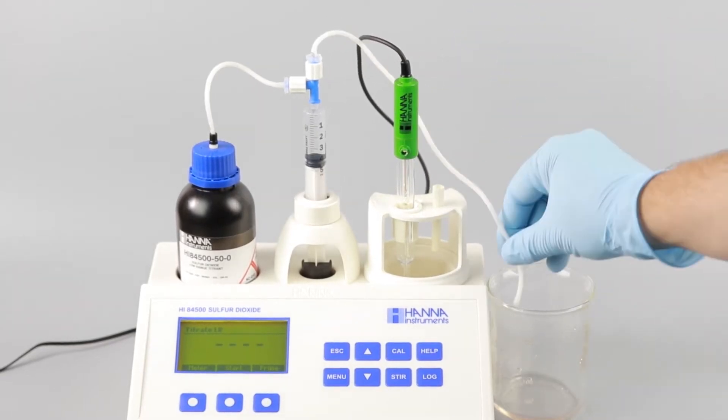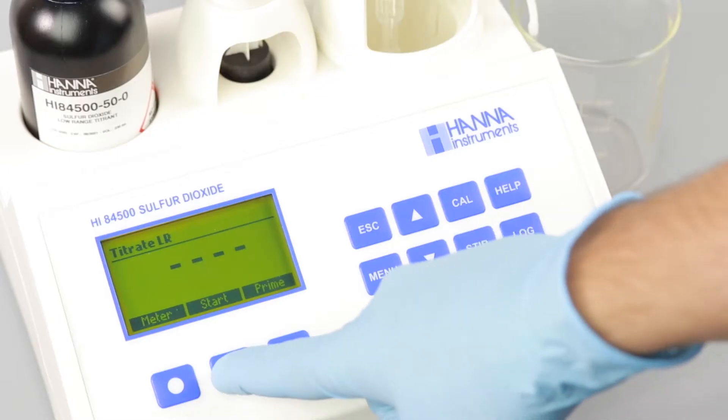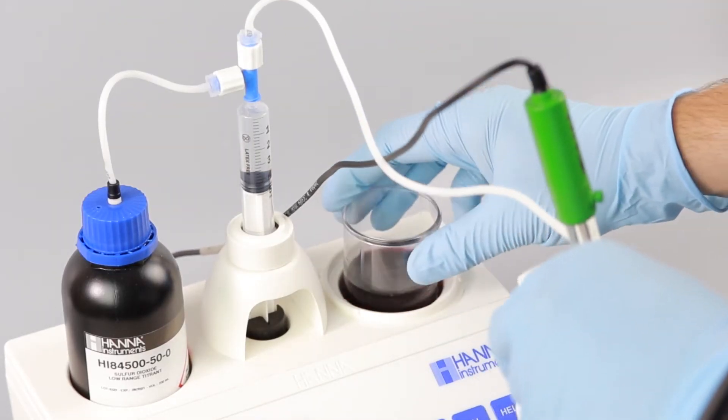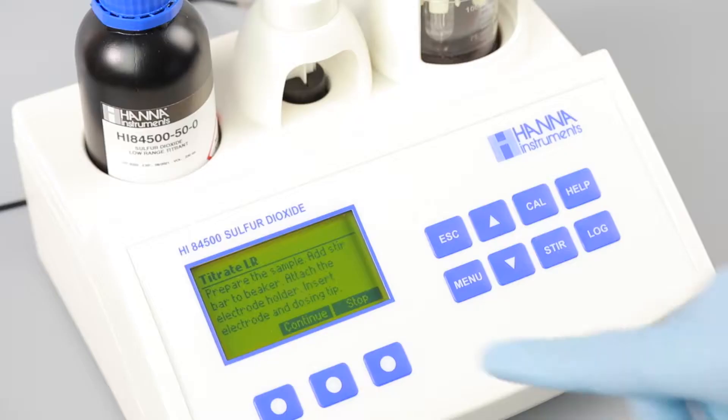Place the dosing tip over your waste beaker and press start. The syringe will refill and rinse the tip. Place your sample in the beaker holder and submerge the dosing tip and electrode. Press continue to begin the titration.